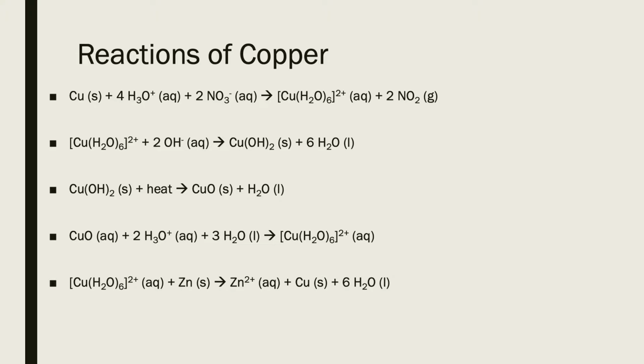Hopefully what I'm going to outline in this video is, for each of these different steps, a quick review of what type of reaction we're looking at. But also, from an experimental standpoint, what are we looking for to know when this reaction step is completed, and what should we be aware of as we're doing that particular reaction step. This week's lab is much more experimentally focused, and there are not as many calculations or other pieces that we're going to spend a lot of time on. But I do want to at least highlight each of the different reaction types, and what we're focusing on for each of them from the experimental point of view.